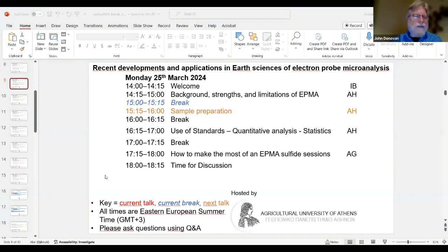I was going to mention, Annette, that reanalyzing standards has been a bane through most of my career, because most of the labs I worked in were horrible from an environmental stability standpoint. Until I finally got to Oregon and got to design a lab from scratch in a new building, which is what you got to do in Minnesota yourself. Yeah, but they didn't take any of my demands into account, and they ignored them and gave me a normal one. But yeah, exactly. I agree, and I've seen it.